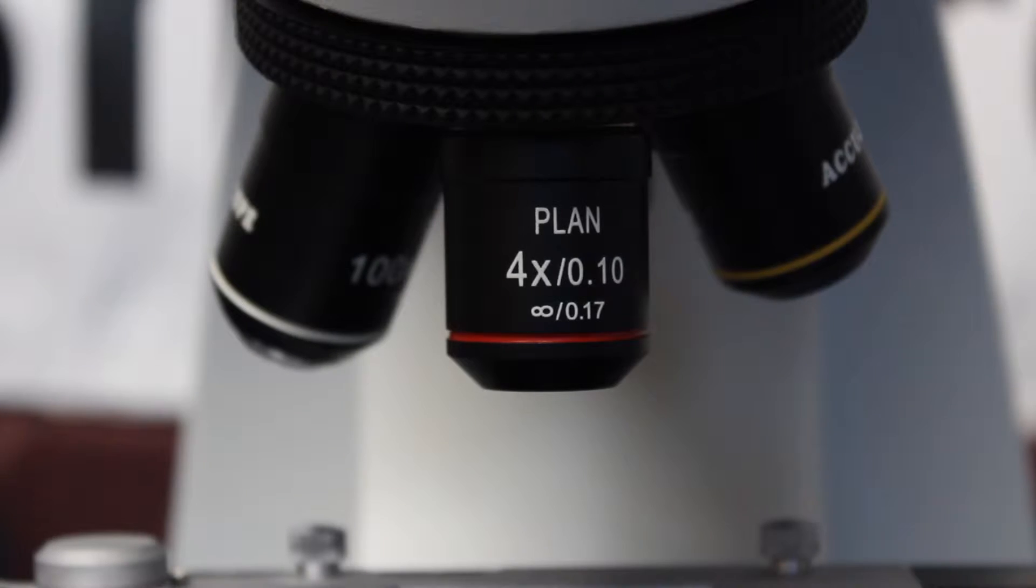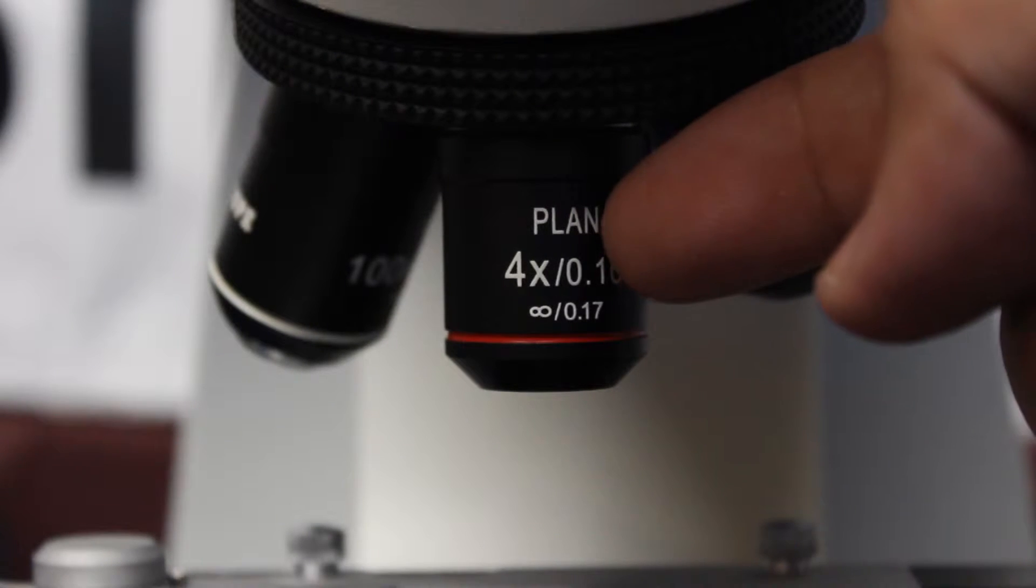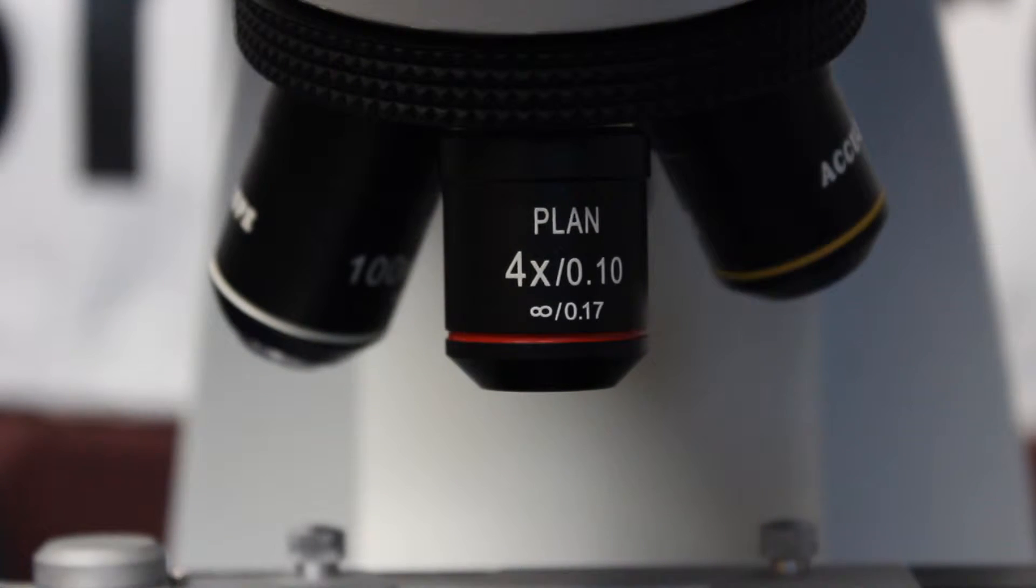If you're wondering how you can tell the difference between plan and DIN objectives it's really quite simple. On the objective itself it'll say plan or sometimes it'll say P, or for semi plan which is in between DIN and plan objectives it'll say SP or semi plan.